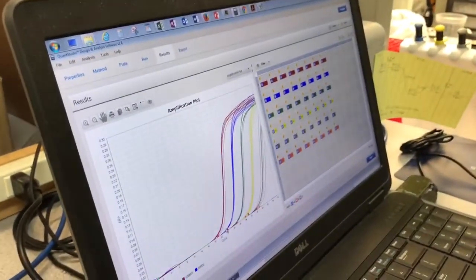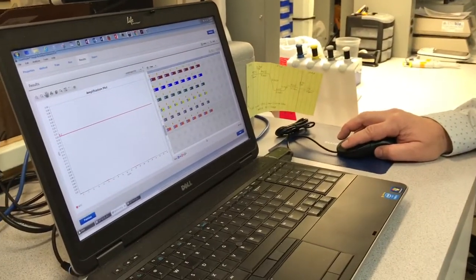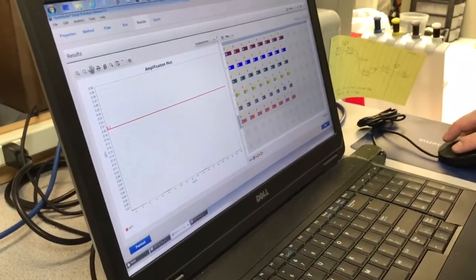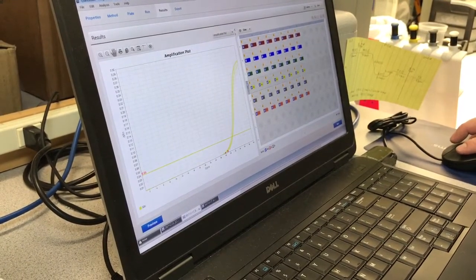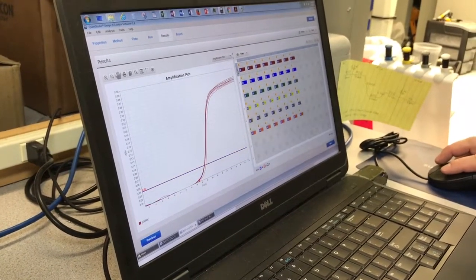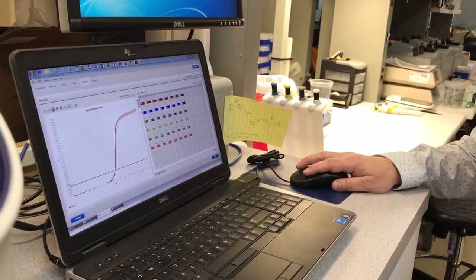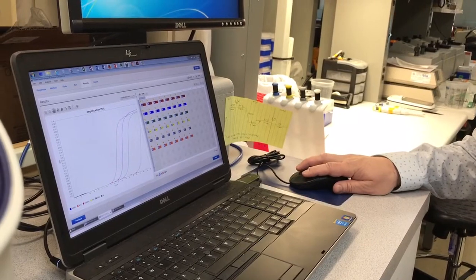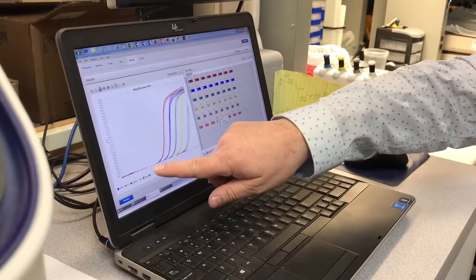So this program will allow you to see if the patient has HIV. That's what it would look like when there's nothing there. We have five copies, 50 copies, 500 copies, 5,000, and 50,000 copies. You can see what's happening — it's starting to go backwards. If you see that, now you're in the dangerous zone. If you start with more copies in the beginning, you get to that threshold earlier — that's how people do the quantification.